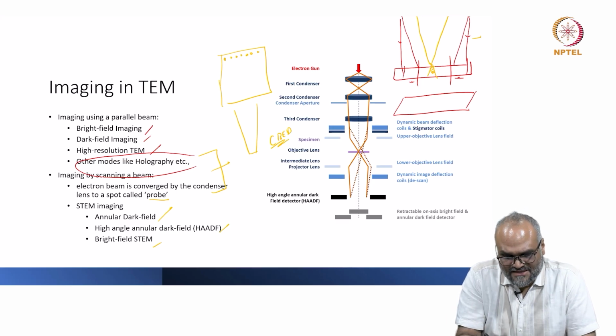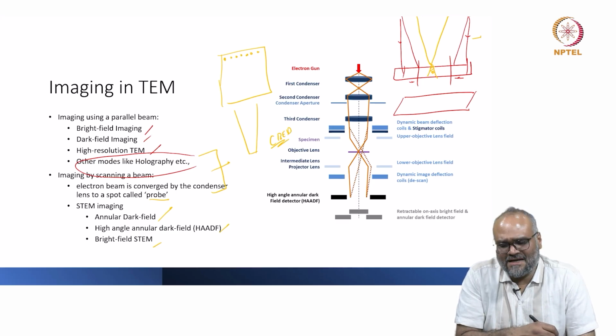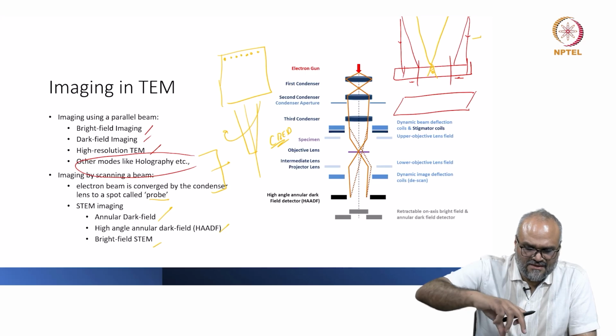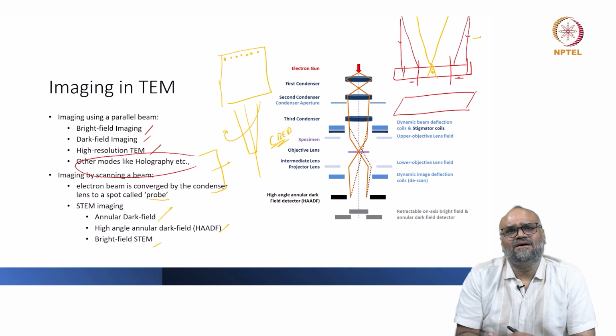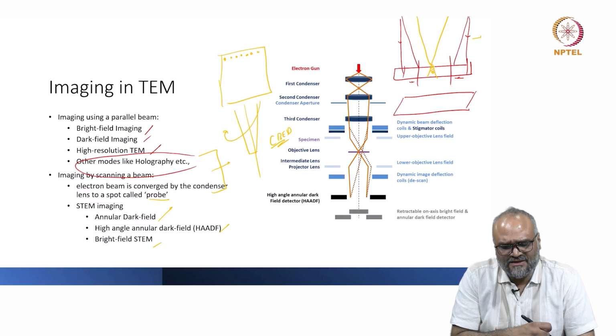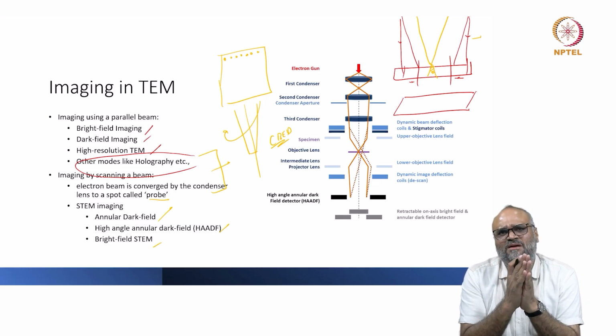And if I have such a truncated cone and I use special beam coils to precess the electron beam over this point, you also have a special methodology called precession electron diffraction. So the idea is I form a probe, but the probe tip is not really sharp.